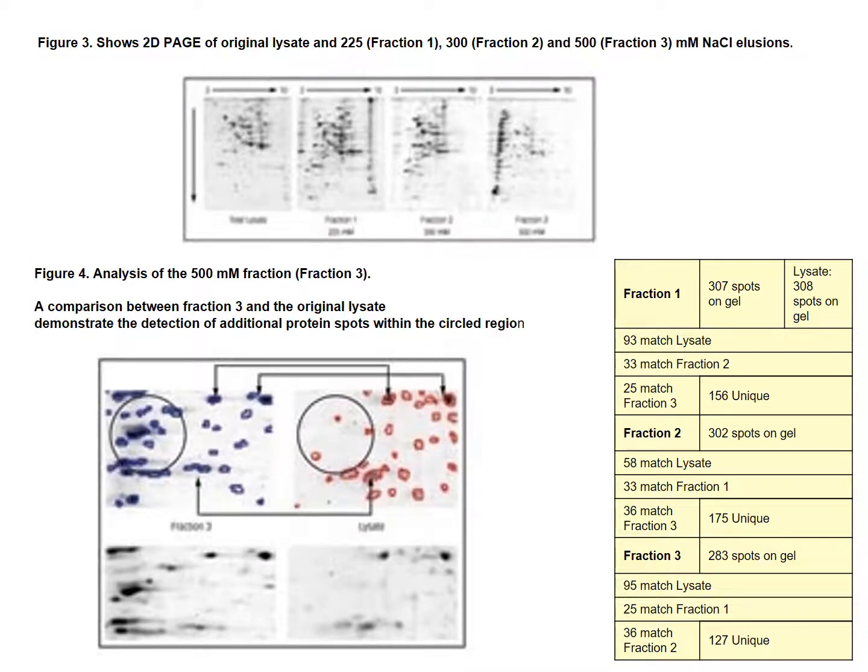Okay, welcome back. We're going to move forward into protein analysis sequencing using mass spec. I did want to start out just reminding about two-dimensional gel. Here's where they fractionated fractions 1, 2, and 3. And this is the data over here. And it actually discusses the number of spots in each fraction of whatever sample they were looking at.